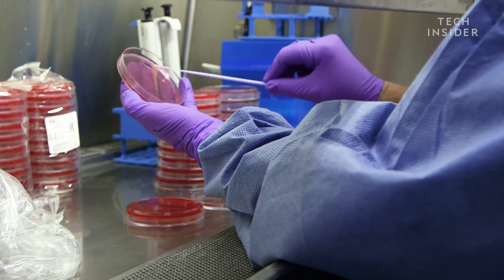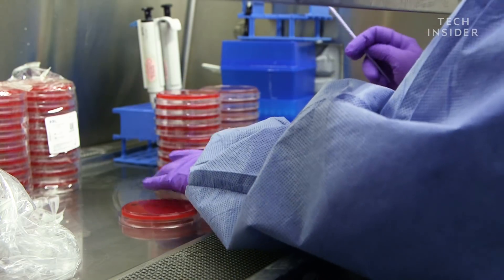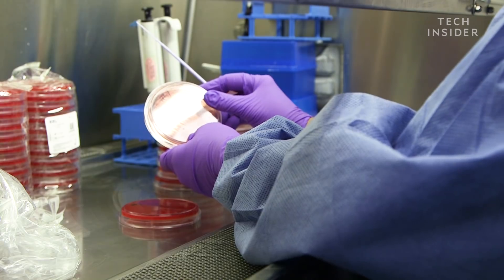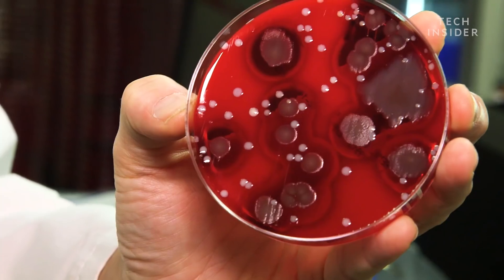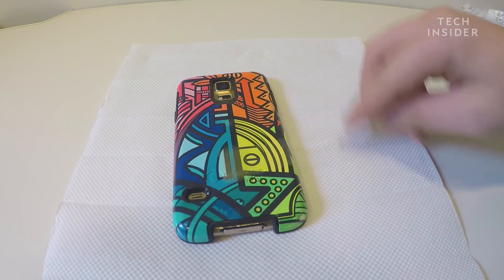The red plate is a sheep blood agar plate and it grows all bacteria. And then this plate is a McConkey plate and it mainly just grows gram-negative rods — bacteria that you would find in poop. In a previous test, Whittier found strains of MRSA and, yup, fecal matter on people's smartphones.